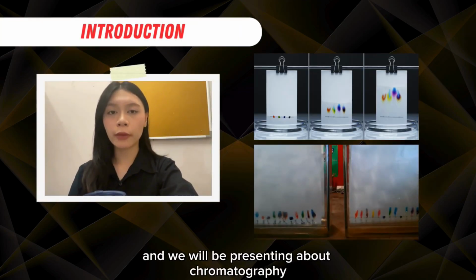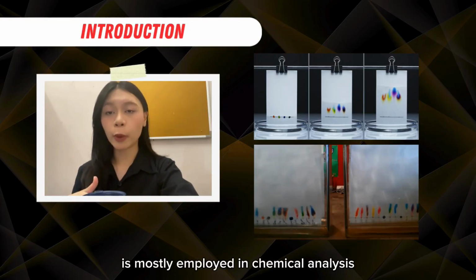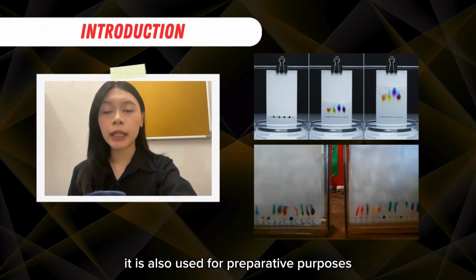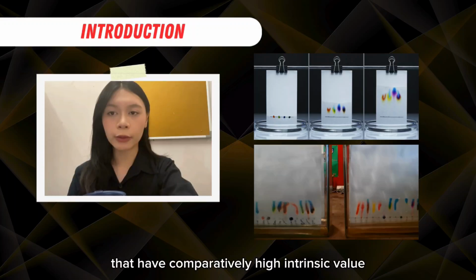Something about chromatography in the forensic and legal field. Chromatography, although primarily a separation technique, is mostly employed in chemical analysis. Nevertheless, to a limited extent, it is also used for preparative purposes, particularly for the isolation of relatively small amounts of material that have comparatively high intrinsic value.